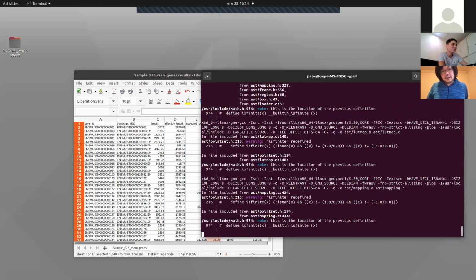I will recommend you try the DESeq as well. There are many ways to do downstream analysis, so you can try other approaches. This DESeq and the Perl script should arrive at the same conclusion.